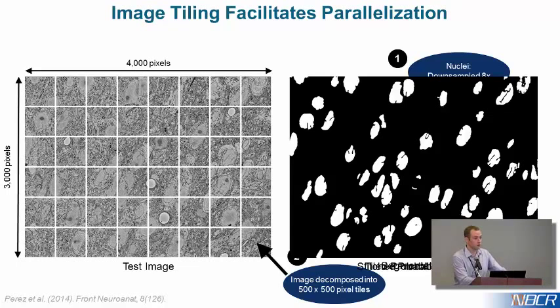Yeah. So it looks like there are some different artifacts, roughly nuclear size. How do you control them? How are you talking about on the segmentation? Yeah, no, I mean in the original. Over here? Yeah. So how do you avoid the segmentation misidentifying those? That's something that we'll discuss in the second lecture.